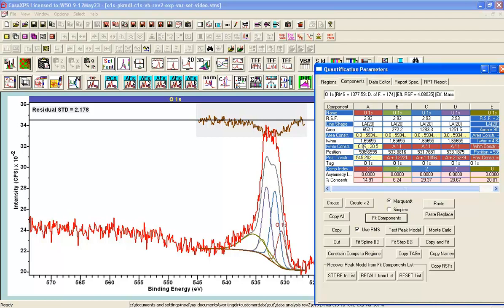We now have fully constrained positions and full width at half maximum, with the exception that they can move a little bit. That's a reasonable thing to do — small variations in FWHM and position are expected since the data were acquired from different points on the sample with repeat measurements and charge compensation used. That's one of the beauties of nonlinear least squares — you can account for small variations.